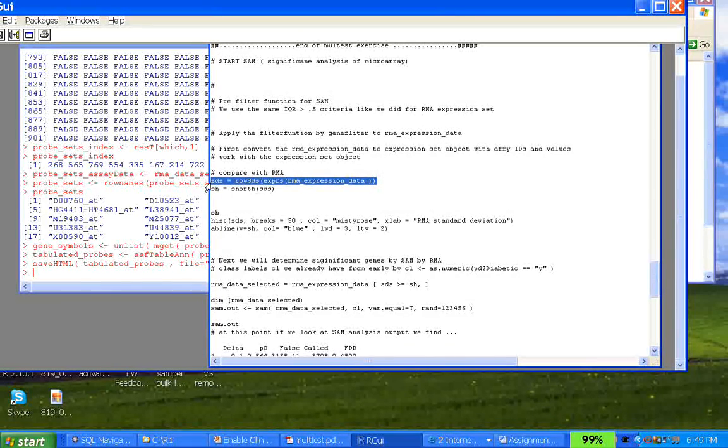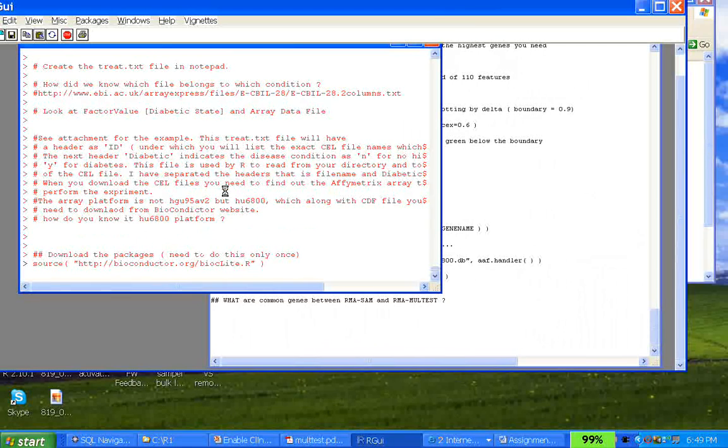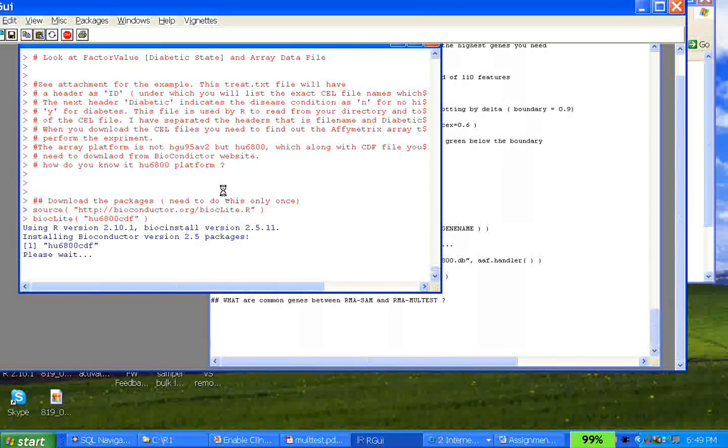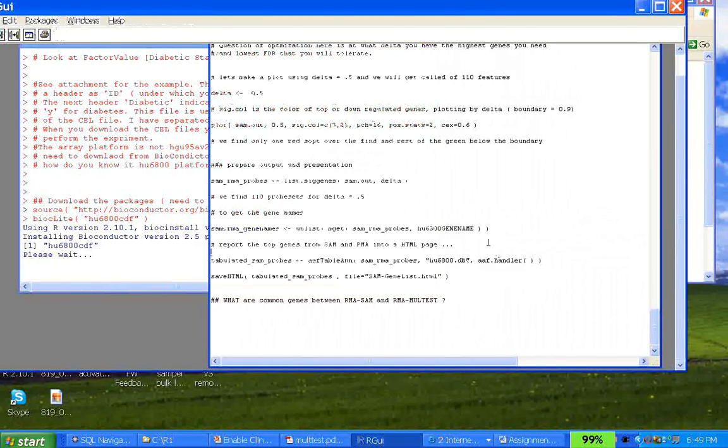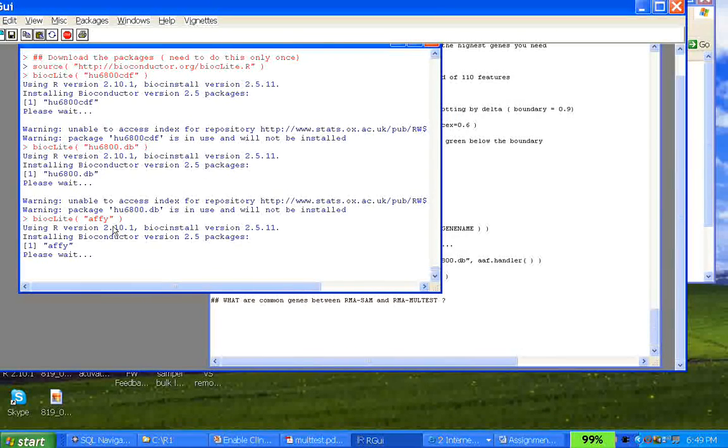So we're casting it. Oh, I'm so sorry. What did I do? I pasted everything. Sorry. Oh, now I wish I could kill it. Somehow when I copied it, everything got copied. Oh no. It's probably not going to be too bad.